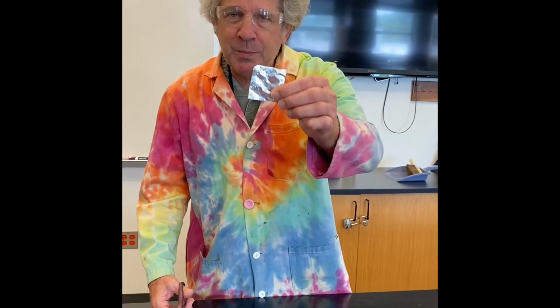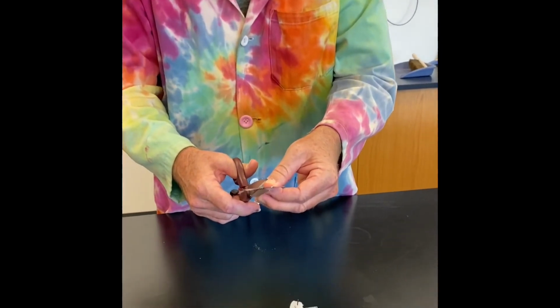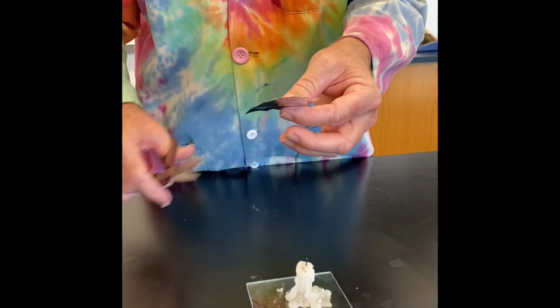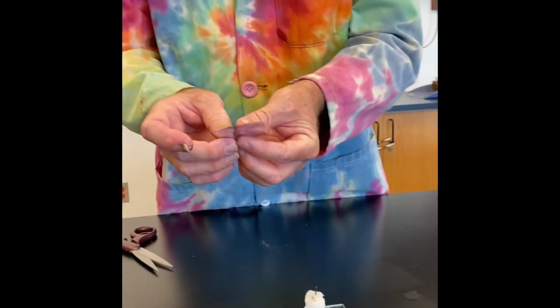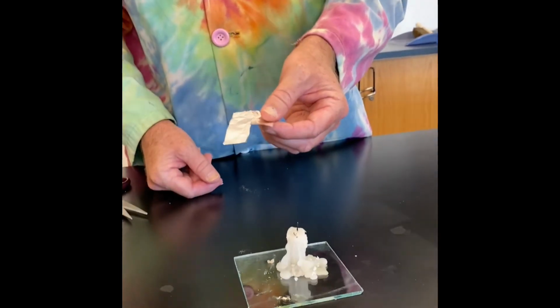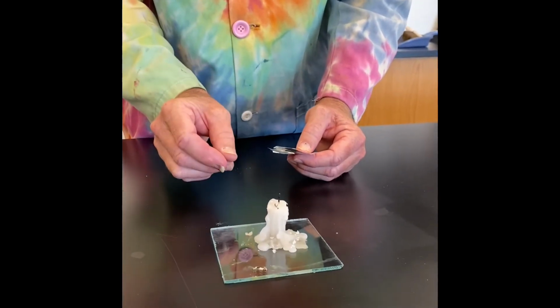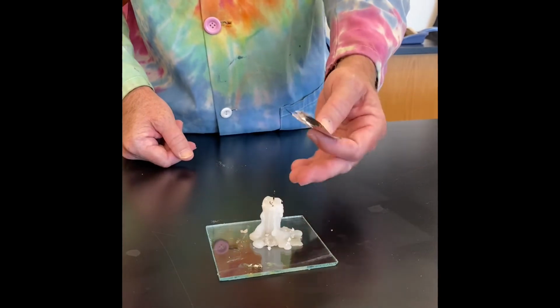With this step, I'm going to take a little square of aluminum foil and a pair of scissors, and I'm going to make a little slit into the aluminum foil, about to the middle of it, like that. Now I'm going to take this square of aluminum foil that has the slit in it, and I'm going to create a barrier between the wick, which is a piece of string, and the wax.